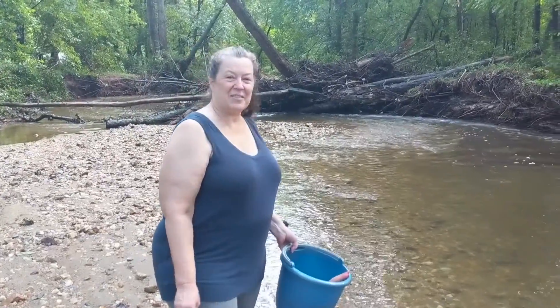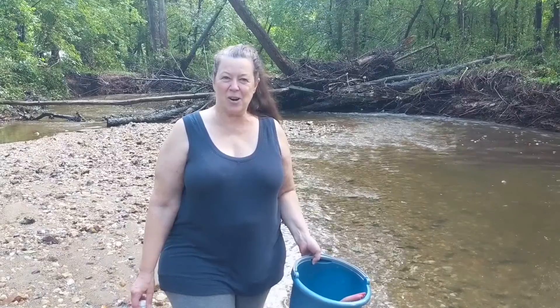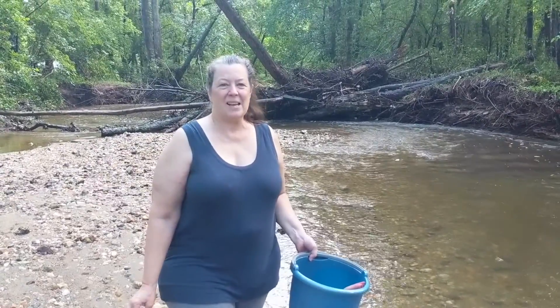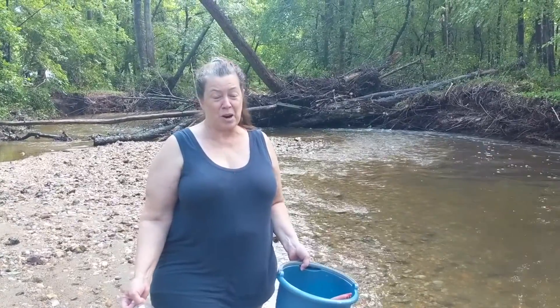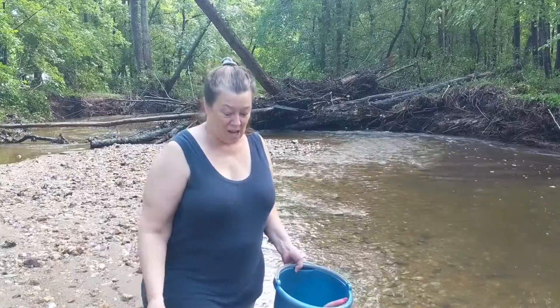Hi guys! We're at a small branch of the Christina River down here in Newark, about maybe a mile from campus, and we're going to be collecting some sediment and fresh water for our first laboratory project, our Winogradsky column.